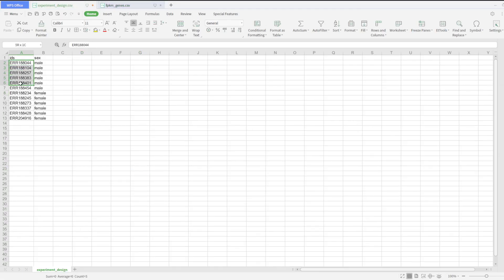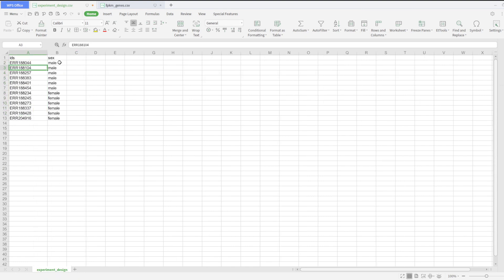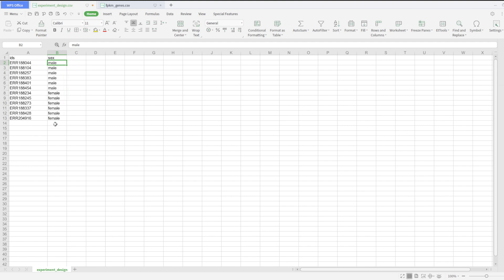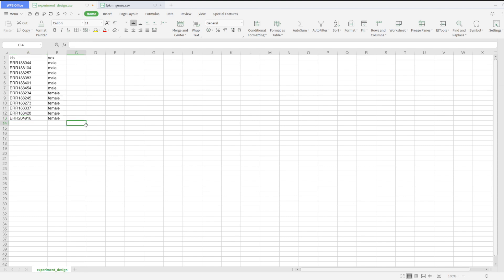Now let's open the experiment_design file. Here you have the sample IDs and also the group that they belong to. There are two groups: male and female. Each of these samples belongs to one of these groups. We are going to use this information later on. Now let's open the R script.